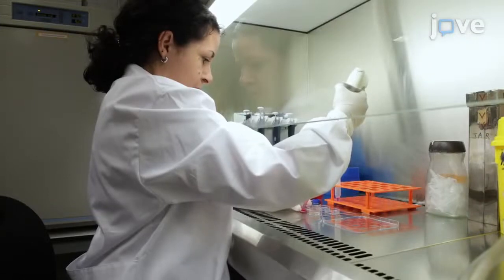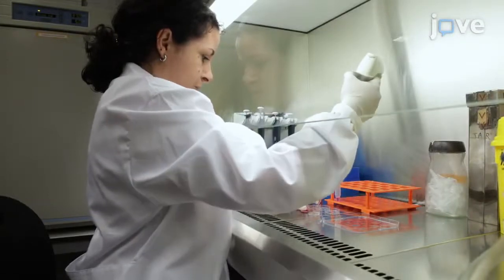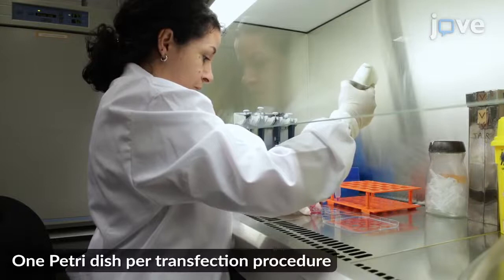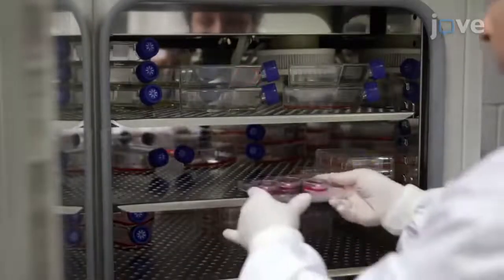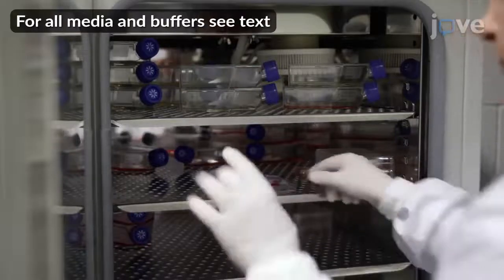To begin, plate 200,000 COS-1 cells into 35 mm Petri dishes and incubate with complete culture medium in a cell culture incubator to reach 70-80% confluency overnight.